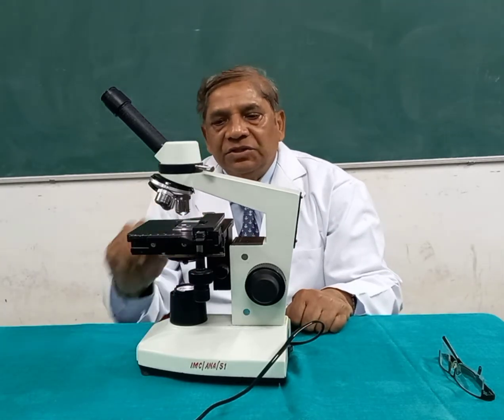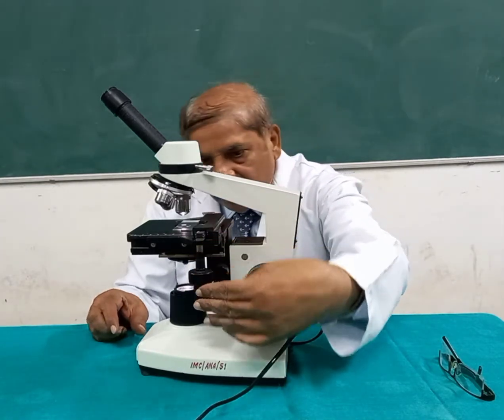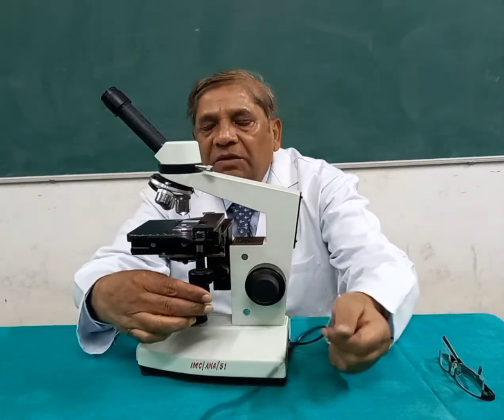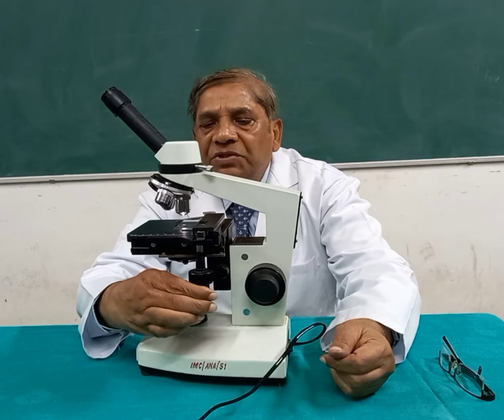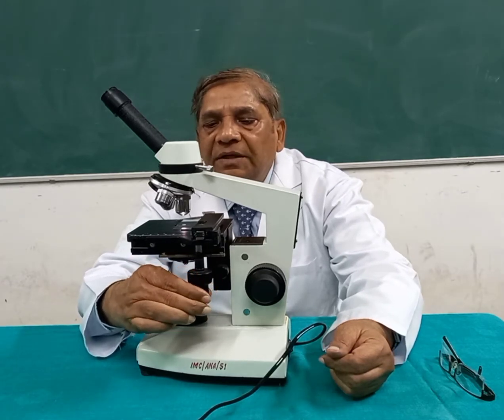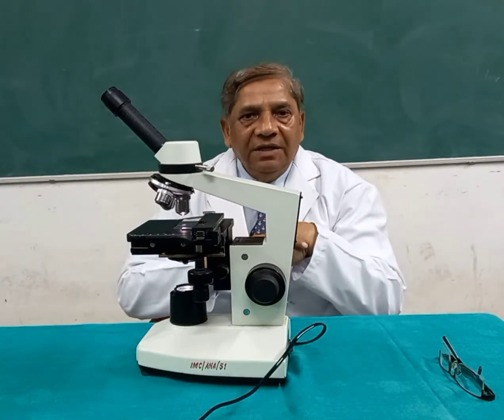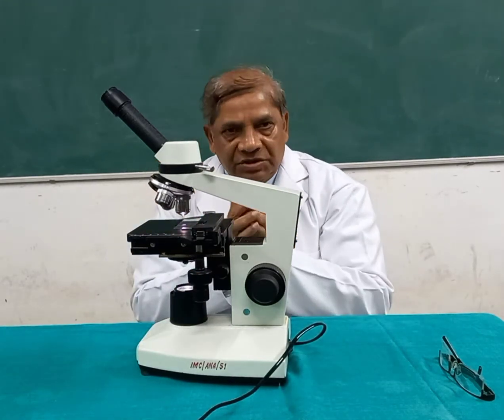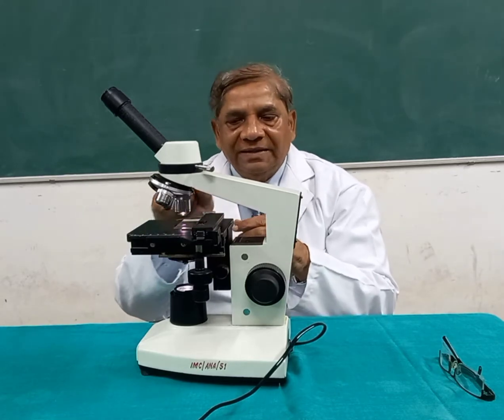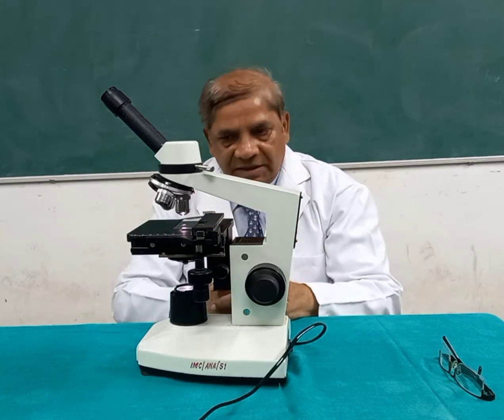And then just bring the stained tissue, which you can easily see, with the help of this knob onto the aperture. There is a hole in the stage through which the light is coming, and the tissue should come just onto the top of this hole, and the light should be seen passing through this tissue. This is another step.